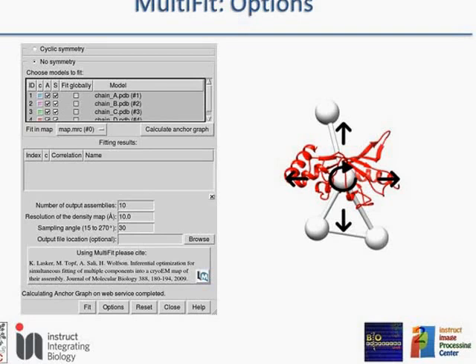So multifit will try this position, move 15 angstroms here, try this position, move again, and evaluate the conformation again. If I click fit globally, multifit is going to use the distances between voxels in my map. Then the whole process is going to take longer, but it also produces better solutions.